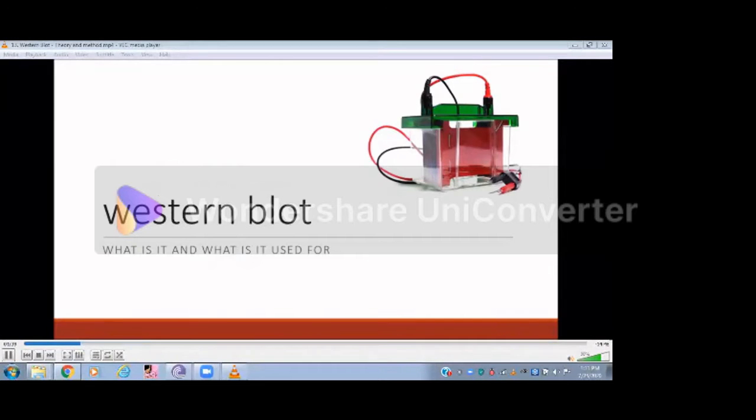So during this short introductory video on the Western blot, I have covered what it is and what it's used for. I'm now going to continue on and show you the entire experimental procedure for the Western blot.